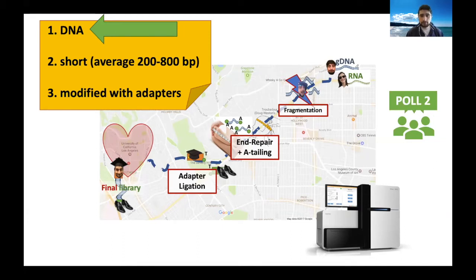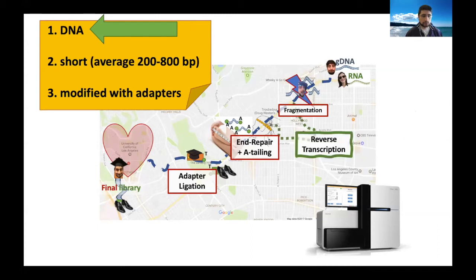Yes, so we're basically converting the RNA into cDNA using reverse transcriptase, and this step is called reverse transcription, of course. That was a good answer. So what we're going to do is perform reverse transcription. However, we are not performing reverse transcription at the very beginning as the first step, for one main reason.